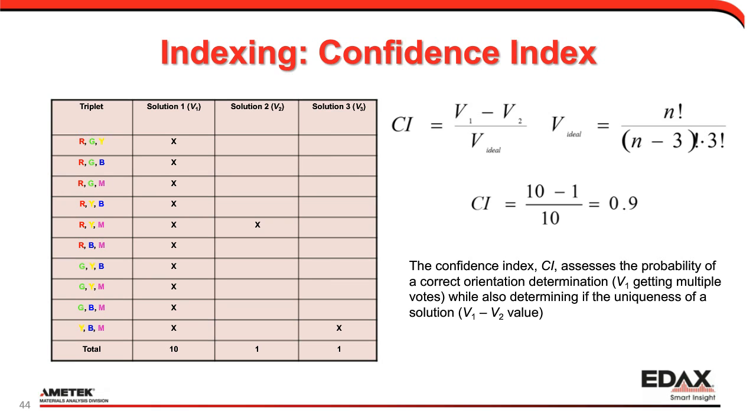And that's important information. It does not necessarily make our job easy, but it does tell us there could be multiple orientations that are close to this. That's where we have to start evaluating things like pseudosymmetry, or whether we need to add more lines to the Hough and tweak things to try to improve that numerator.